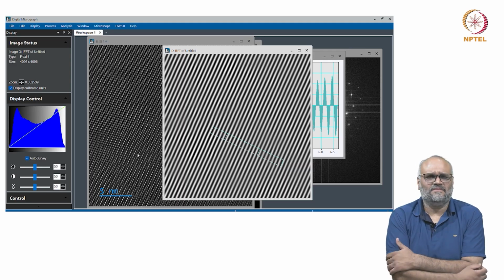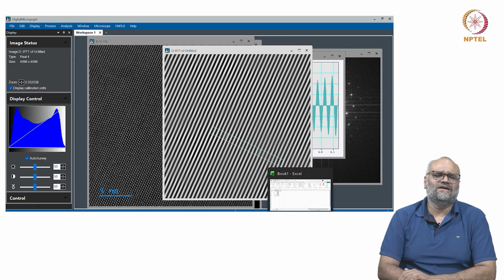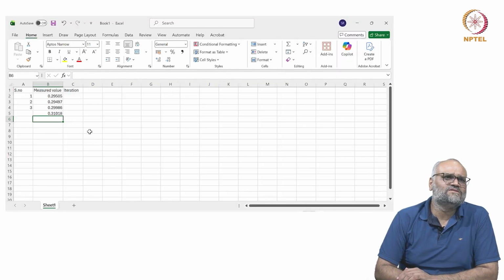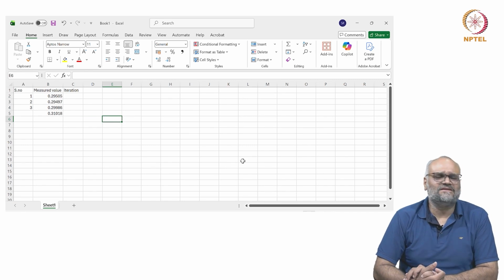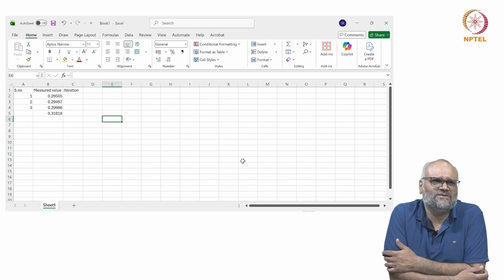And I have done this several times on different cases and examples, and most commonly when you do this kind of manual measurement, the deviation between your real values and your expected value can range anywhere between 10 to 15% depending on how experienced you are at looking at the micrographs.